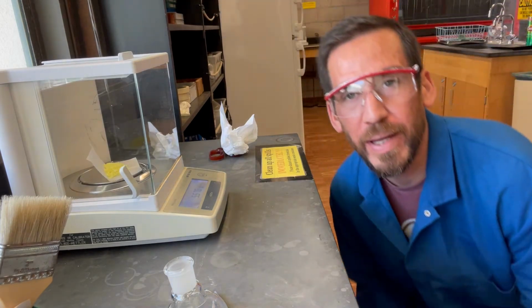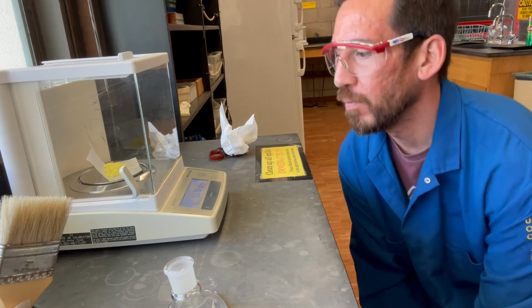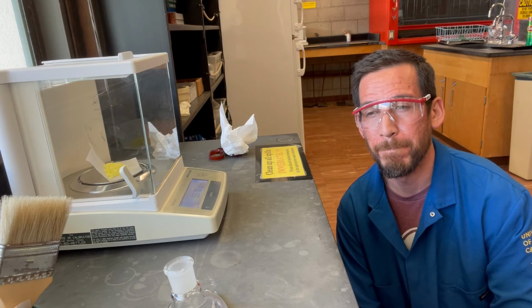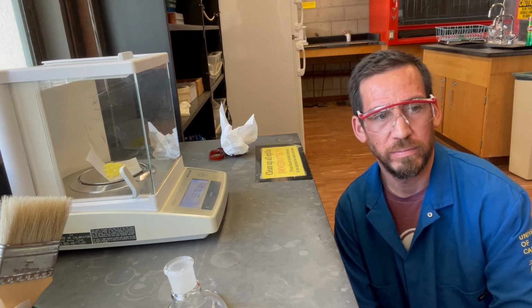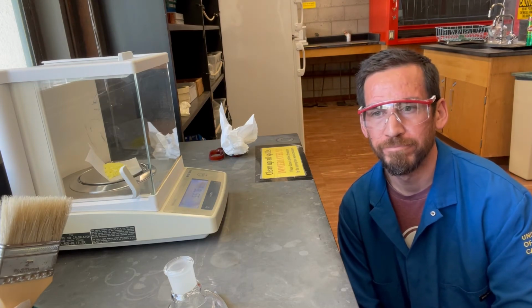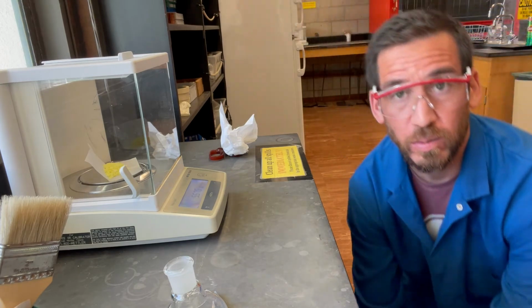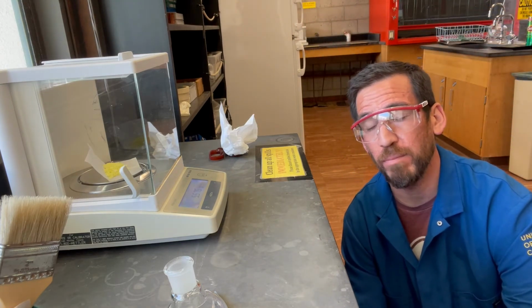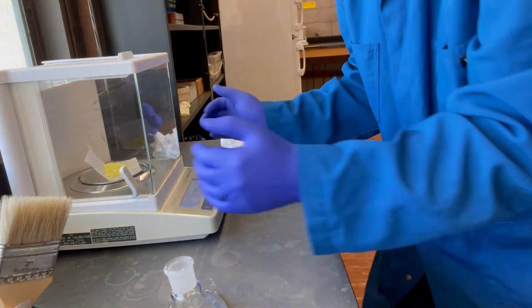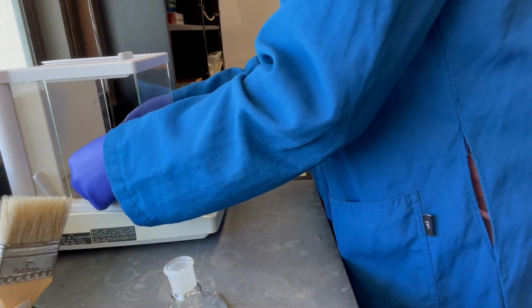5.5. Where you at? 5.576 grams. So we only need 4.41 for the next reaction. 4.4. Ah, no, 4.1. Anyway, let's just throw it in there. Whatever. We'll scale up the reaction a little bit more next time. How about that? You down? I'm down. 5.575 now is what we're going to go with.